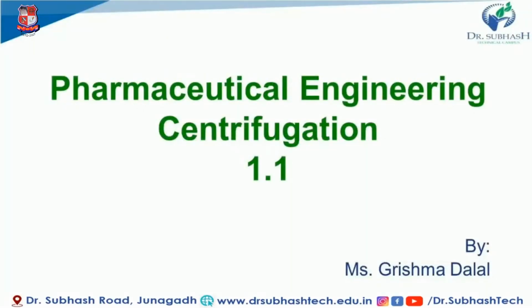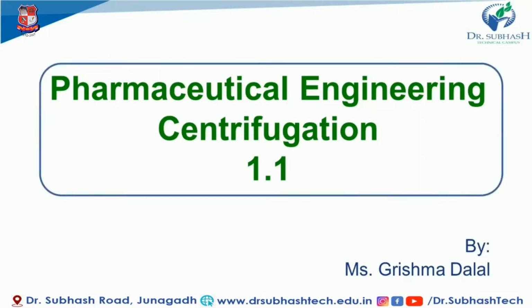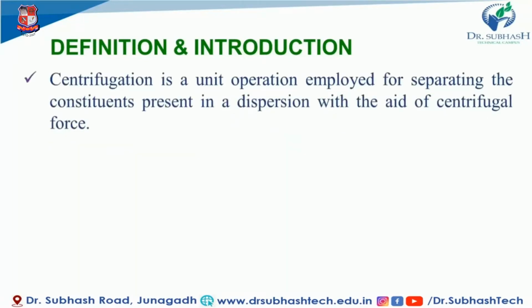Self Grishma Dalal from Faculty of Pharmacy, Dr. SUBHASH Technical Campus. Today we are going to focus on centrifugation as I mentioned in my last video lecture. So first of all, we are going to see the basic things about what centrifugation is. So here is the definition. Centrifugation is a unit operation employed for separating the constituent present in the dispersion with the aid of centrifugal force.